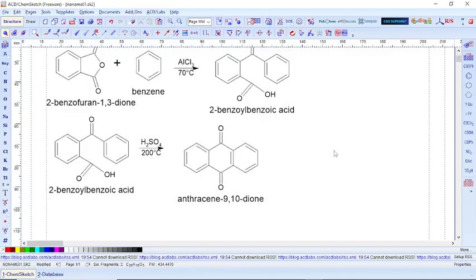You will now ask yourself, if I'm targeting 10 grams of this product, what mass of benzoic acid can generate that 10 gram? Maybe we may have that 5 gram of benzoic acid will produce the 10 gram. Then you now go back again.